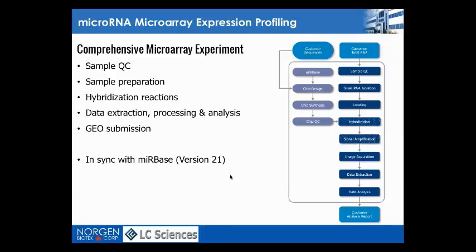So that was the method that the microRNA community started out with for profiling, and then especially for the discovery, next-gen sequencing took over. You will find different terms: RNA-seq, microRNA-seq. It's pretty much all the same. Basically, next-gen sequencing using RNA samples. It has the advantage that it can give you a much broader, comprehensive view of the transcriptome. So you can run samples not only to look at the microRNA level, but also, of course, messenger RNA, non-coding RNA, long non-coding RNA, etc.